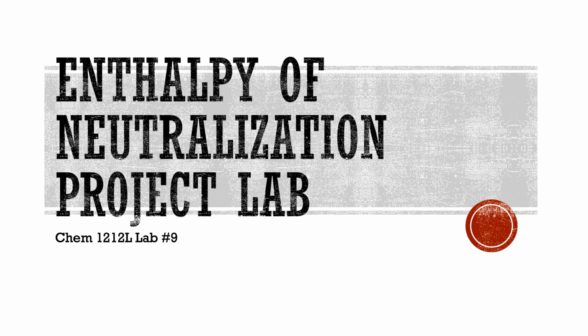This week's going to be a little bit different in the fact that we're going to start a multi-week semi-project. You should be able to do pretty much all of the experimental portion of the lab this week. Then you're going to take some time over the next couple weeks to write a formal report on it, which is something new that you haven't done. I'll probably spend most of my time in this video talking about the expectations for that formal report.